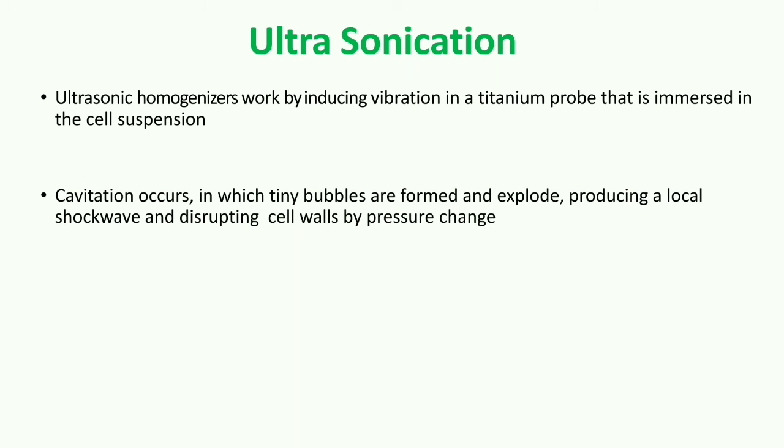Due to the vibrations induced by the titanium probes, a process called cavitation occurs. In cavitation, many tiny bubbles are formed and they explode, producing a local shock wave and disrupting the cell wall due to high pressure changes. Alternatively, high frequency ultrasonic waves can be used to generate a transient pressure.